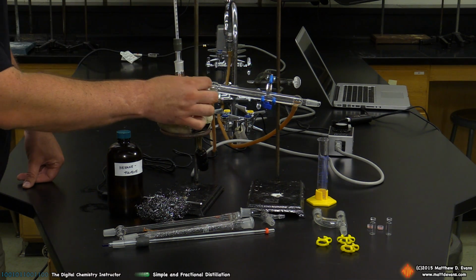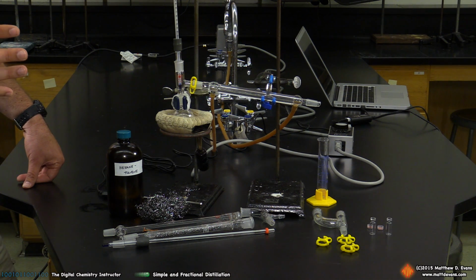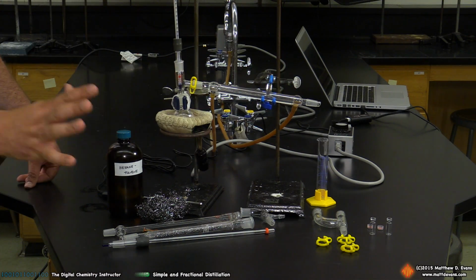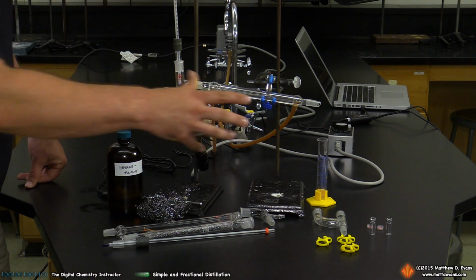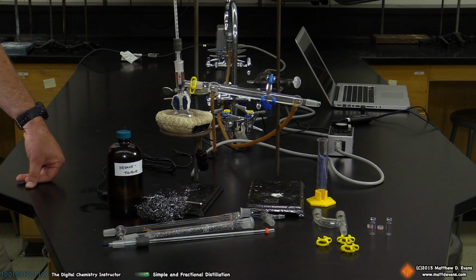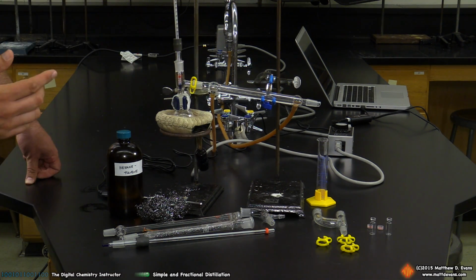As soon as those hot gases hit this part of the condenser, they're going to be cooled immediately by the water that's always passing through the outer water jacket. They condense, they start to drip down, and eventually we collect those drippings, that distillate, as a liquid. You're going to monitor the process by looking at the milliliter collections, so you've got to constantly monitor how many milliliters of distillate you're collecting in this little graduated cylinder.